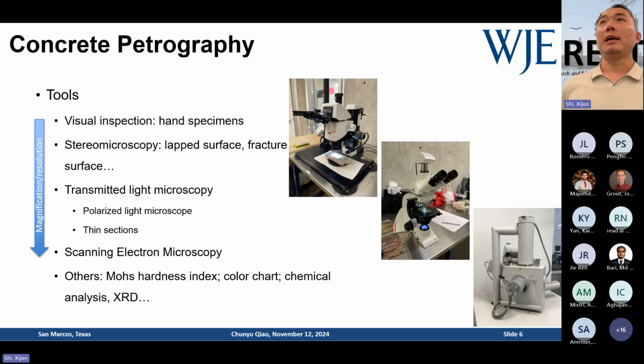And you can also use X-ray diffraction to look at any altered minerals or phases in your cementitious material compared to the unaltered ones, to see what the mechanism or progress of the deterioration is in different scenarios.